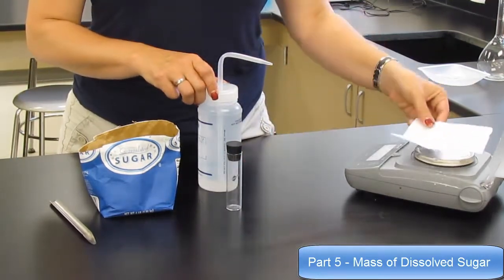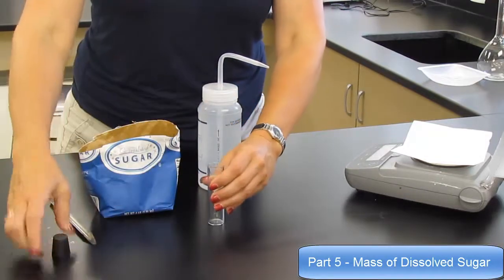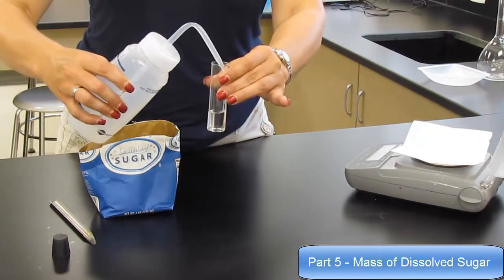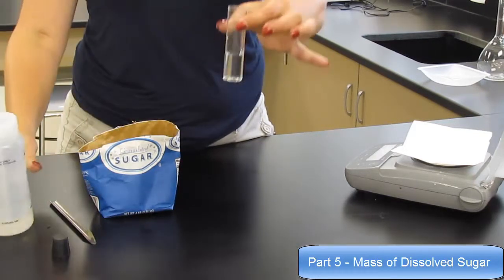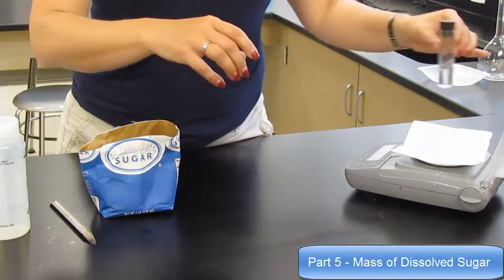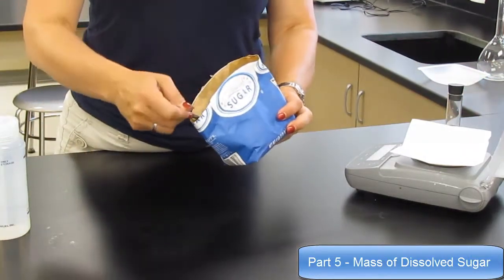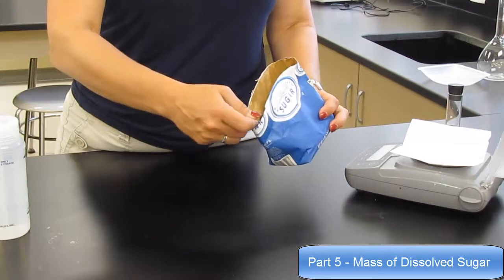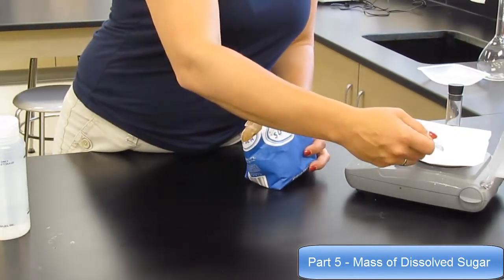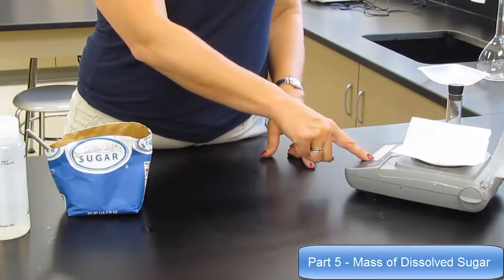Then take some of your distilled water and put it into your vial. It doesn't need to be a lot. A quarter to a half will be plenty. Take your stopper, your vial, your water, your tare paper, and now put a little bit of sugar on. It doesn't need to be a ton. And take the mass of all of these things together.